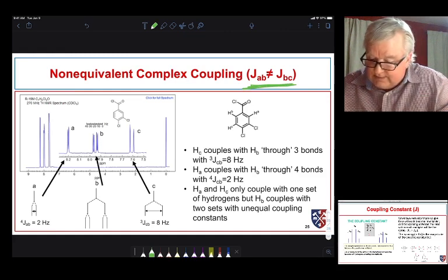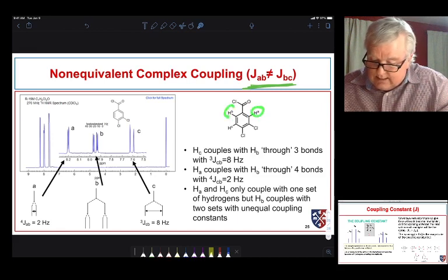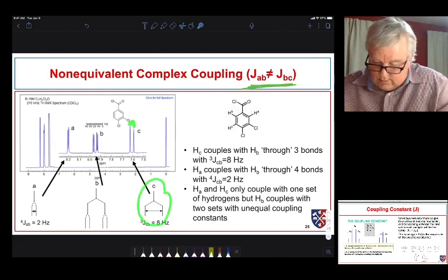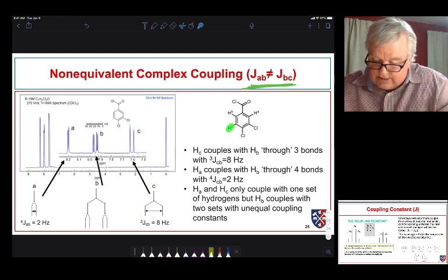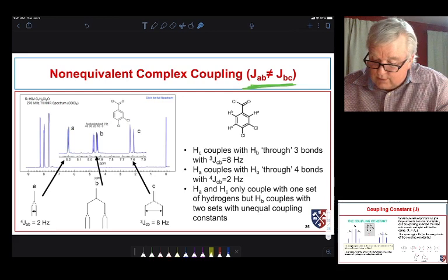Let's take a look at non-equivalent coupling in a case where we have a big coupling constant and a small coupling constant. In this particular molecule, we have three signals. We have HA, HB, and HC. What we see is a nice, simple signal over here. That's due to this coupling. This is due to this proton right here, HC. Okay, and it's coupling with B with a coupling constant of 8 hertz. Over here, we see nice, simple coupling. This is due to proton A, and it seems to be coupling with something.